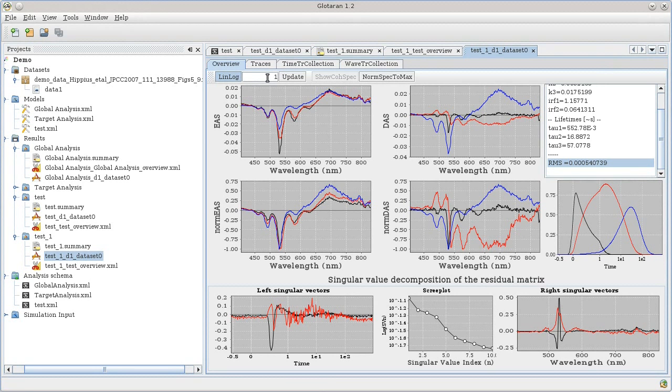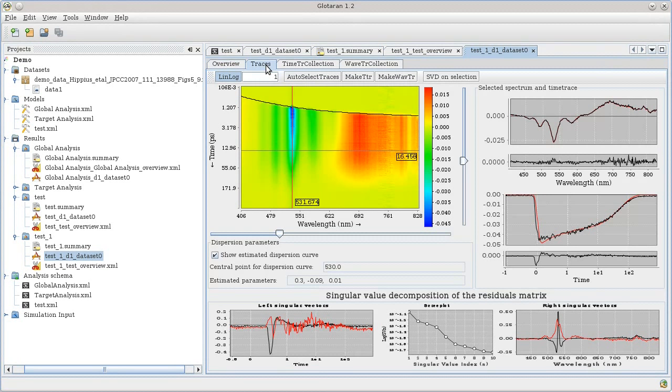The number controls which part of the chart is linear. In this case, the axis is linear from -1 to 1 picosecond and logarithmic thereafter. The time axis will be centered around time 0, which is defined as the maximum of the IRF. The linlog setting applies to the time traces of the singular value decomposition, the concentration profile, and to the time traces in the traces tab. Especially with the time traces, you can clearly see the improvement by using a linear logarithmic scaling.